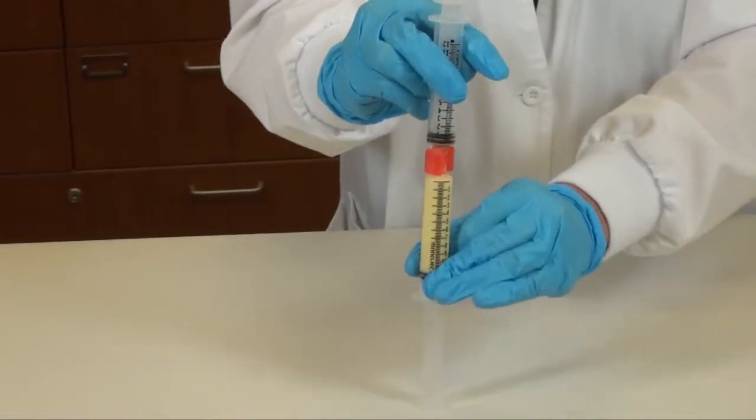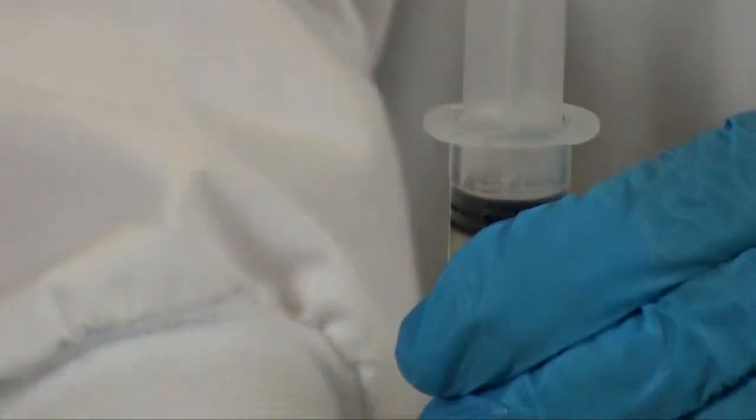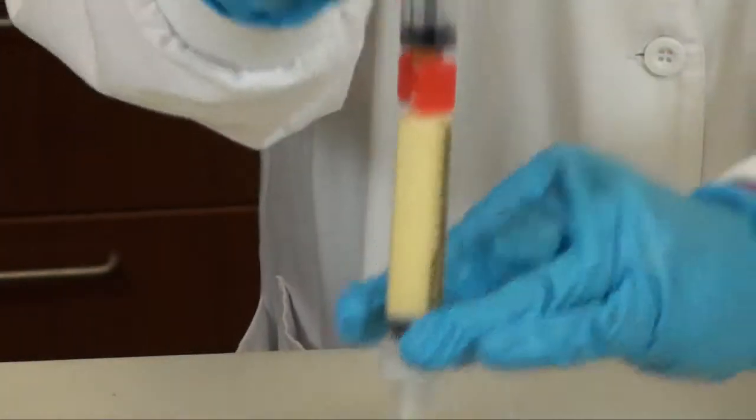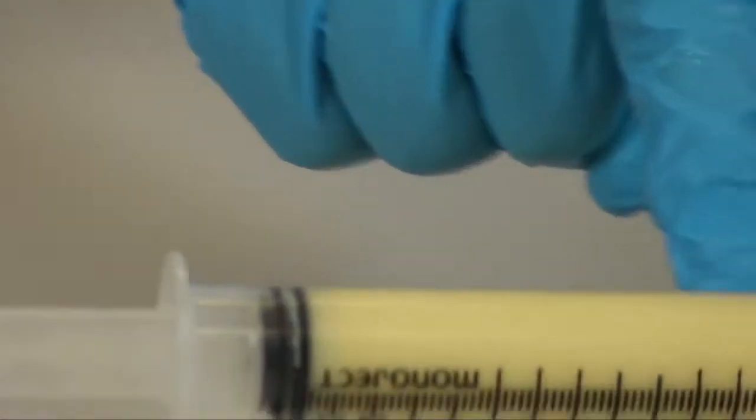But back and forth. Periodically check and make sure that both sides are still luer locked on and continue to do this until you have a uniform PLO gel.